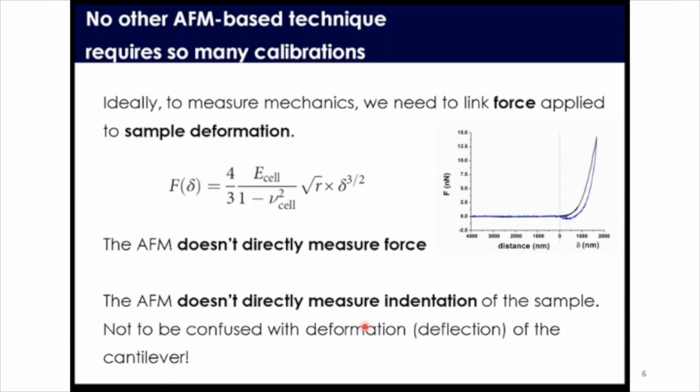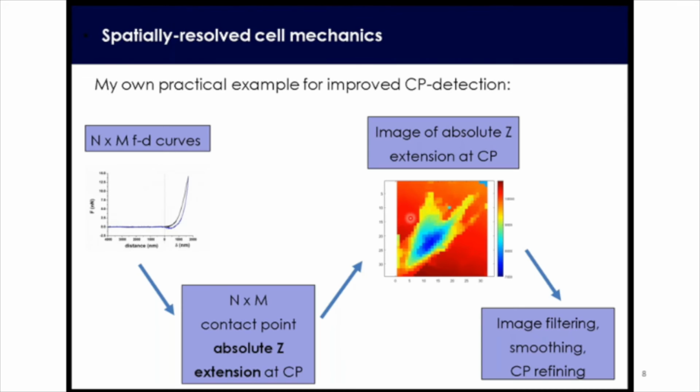able to calibrate that. So AFM, when properly calibrated, doesn't just measure the force and the displacement of a cell at just one point. It can actually be used to measure this at many points in a 2D grid. So what's gathered with this information is a 1D signal across with the force and deformation on a 2D grid.